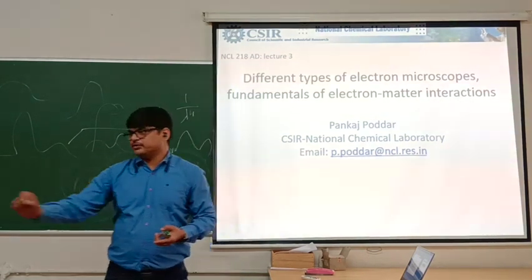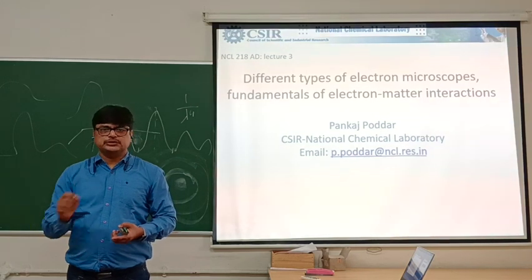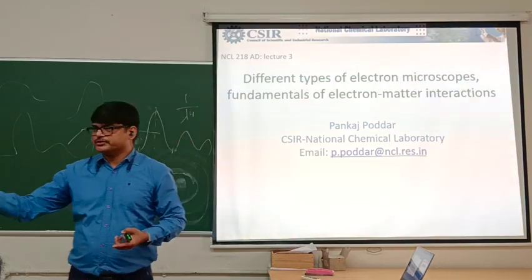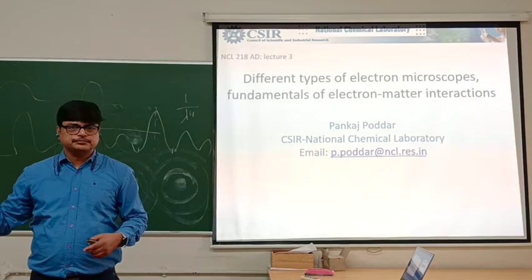Suppose I want to do the mapping of my particle. Suppose I have a catalyst and I want to see where I have hooked something, where the oxygen atoms are, where the zinc atoms are, and where the platinum atoms are. Suppose I made an exotic catalyst for some automobile.